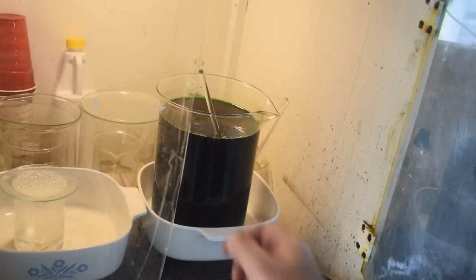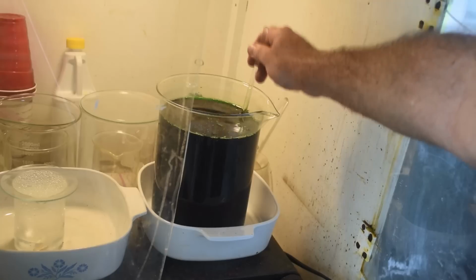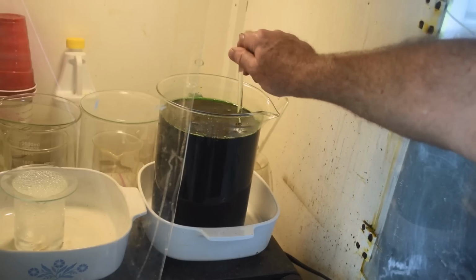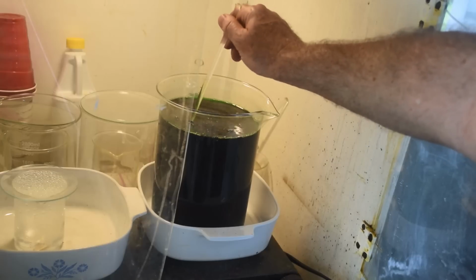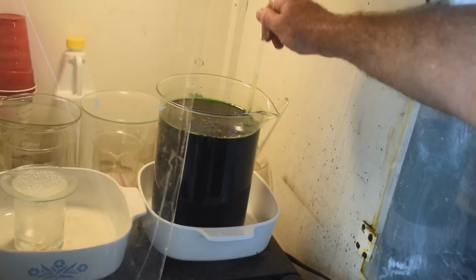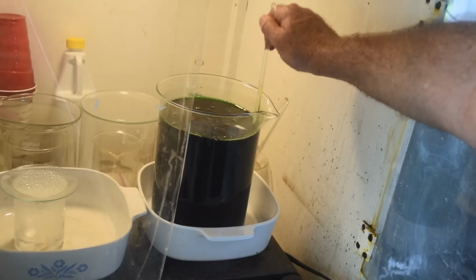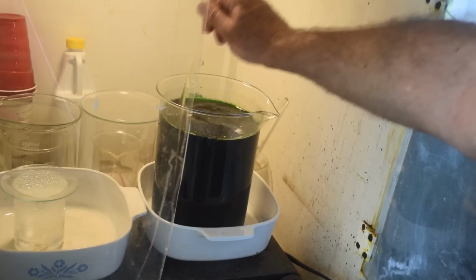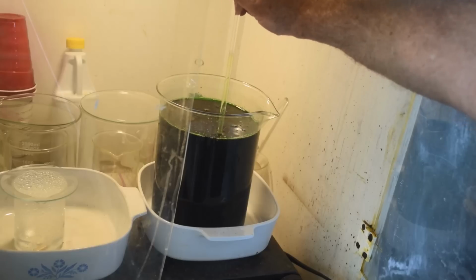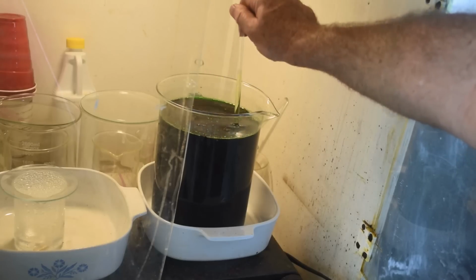All right, so this has been sitting here for 40 minutes, an hour maybe, and I really think that the solids in here are starting to dissolve and break up. I was worried that I had created something totally insoluble here, but it certainly feels like it's starting to break up and go back into solution. Yeah, there's still some big clumps in there, but some of it's definitely gone back into solution.